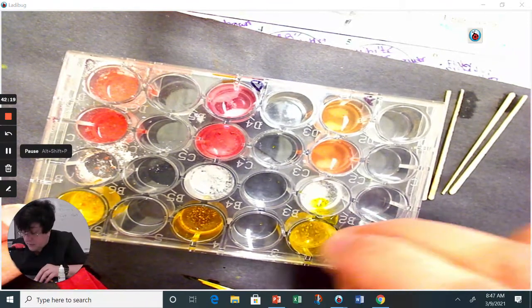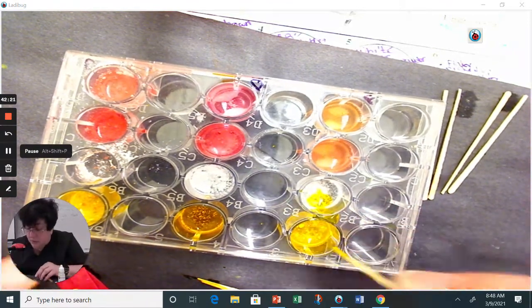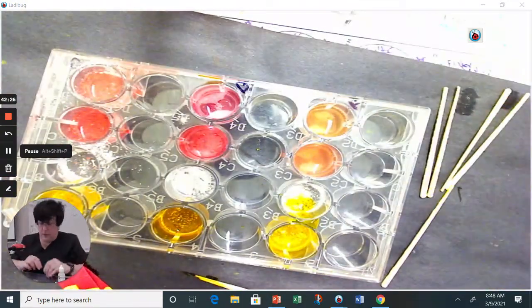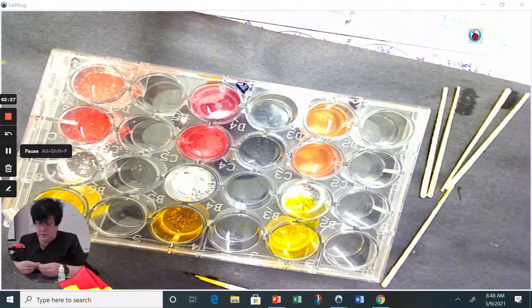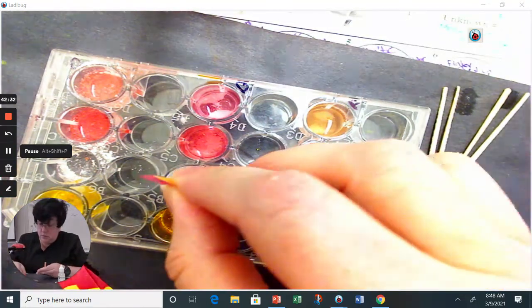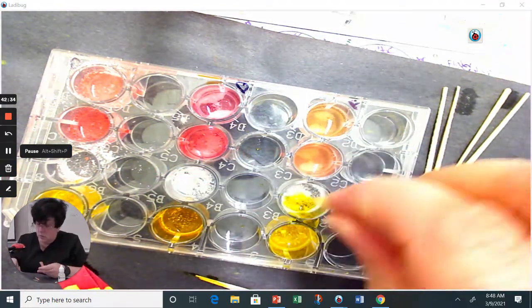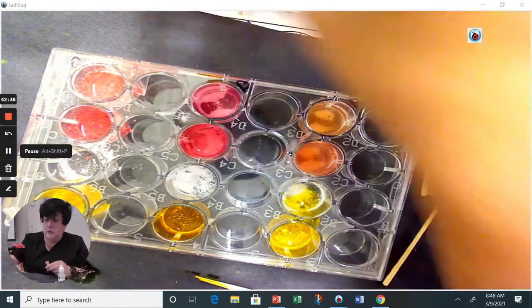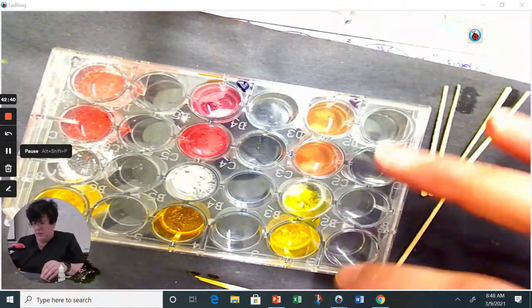Now that was unexpected because I really expected that to turn color. Okay. Now go back and retest our wonderful pH on these with the acid. Nope, still 1. Still 1. Still 1. Okay. So none of them are working very well to control pH.